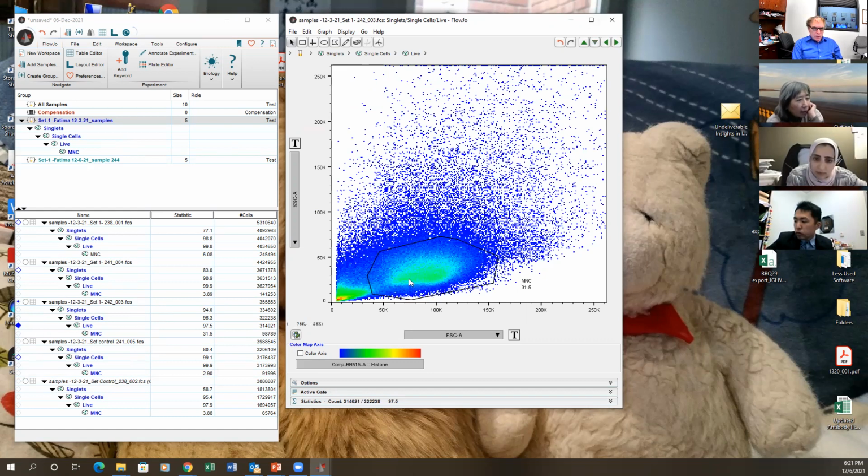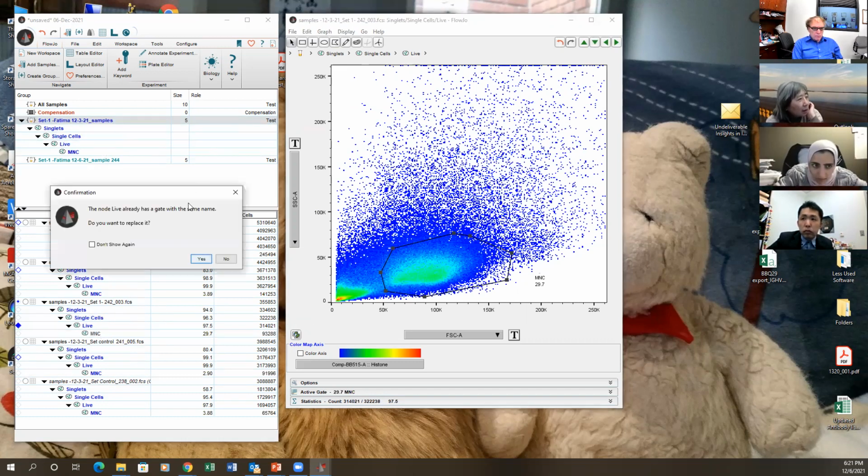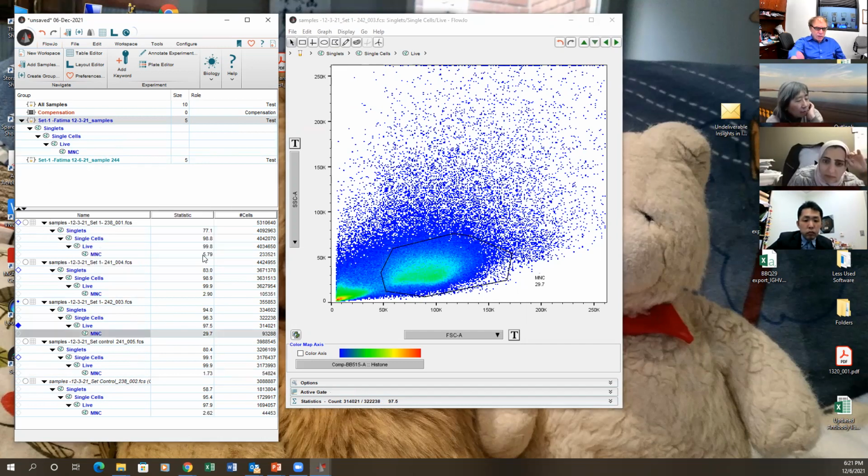Oh, that's a good one. So in a way we can use this one. Now I moved it in, I could readjust the gating here. This one did not have so many beads. You know, because you count the 5 million, but most are beads. Whatever this sample is, whatever you did, if you can remember, this is the best one. But on the other hand, for some reason, we lost a lot of cells. See, it went all the way from 100% to now some are just 2%. Yeah, that's true. So what does that mean this time?